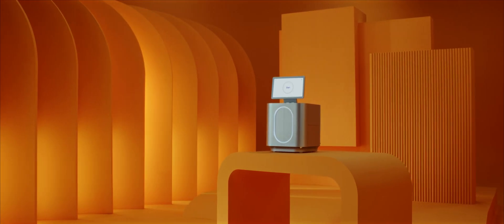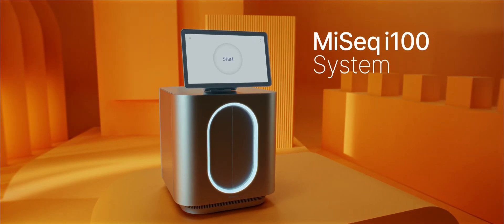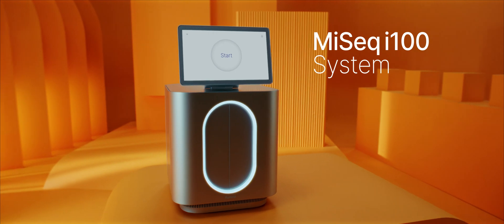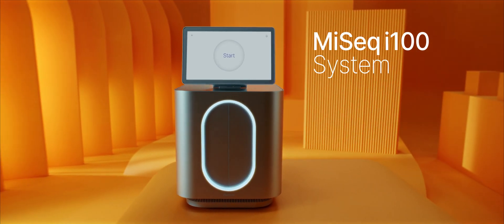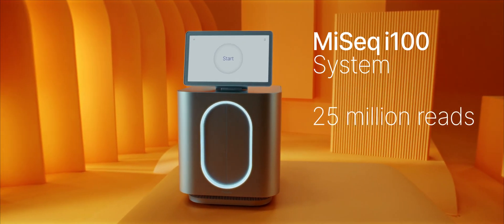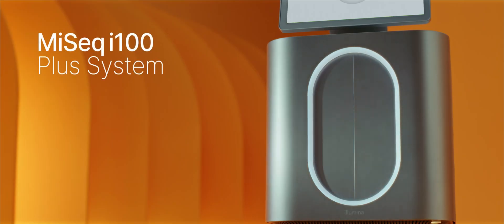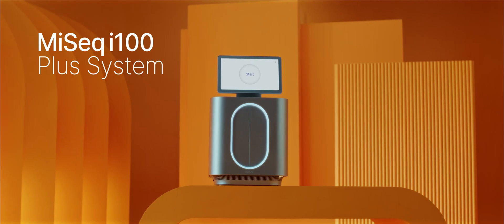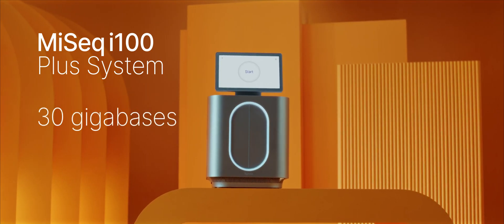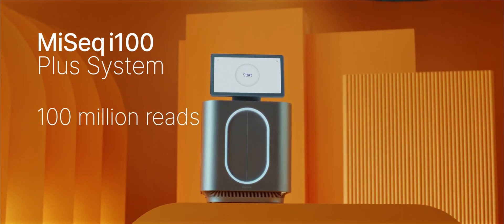The series offers two systems. The MySeq i100 system enables 15 gigabases of data output with 25 million reads, and the MySeq i100 plus system has an expanded output of 30 gigabases with 100 million reads.